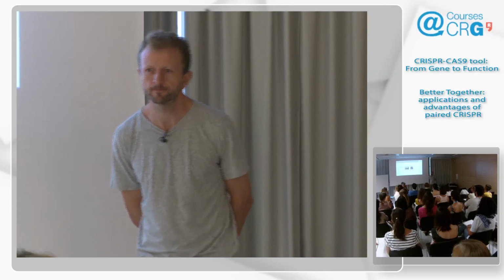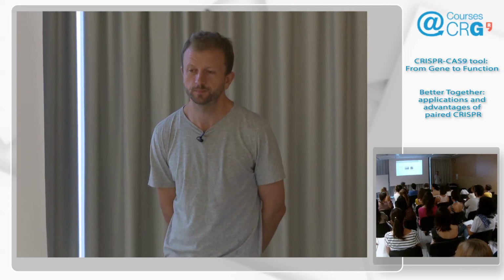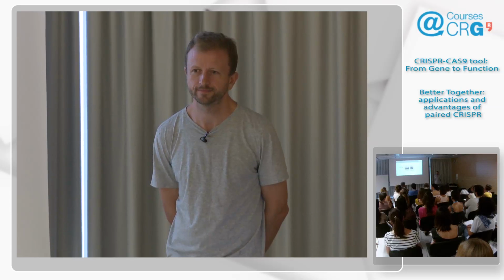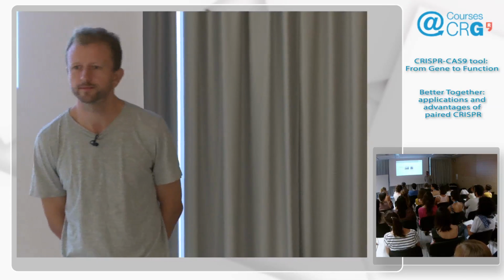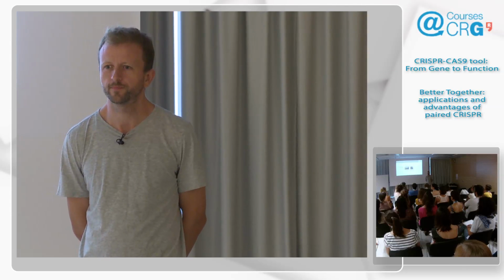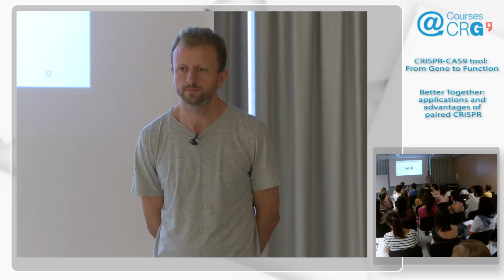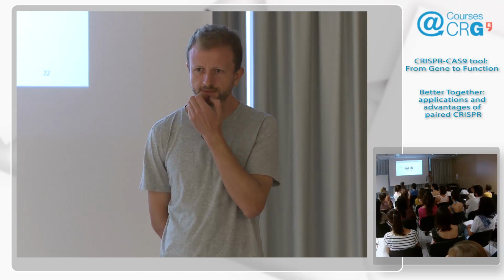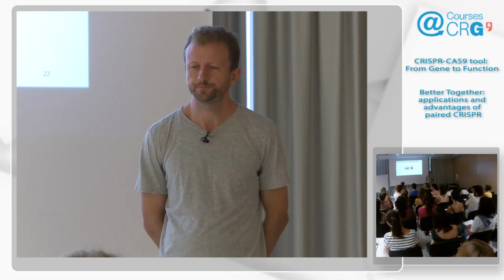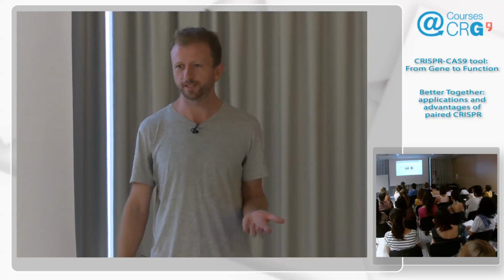Really fast. And are both efficient, or is one better than the other? For most of them, both are efficient. What we couldn't do with this fast lysate were the genomic PCRs for very long amplicons. When we were deleting 3 kb, we couldn't do these PCRs with these lysates. But for regions that we deleted up to 1 kb, it was fine. Estelle should be giving this lecture instead of me.